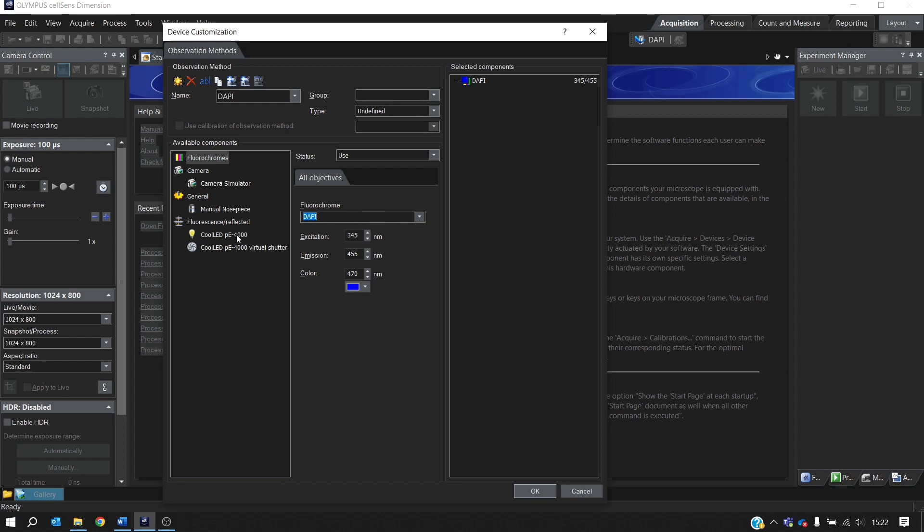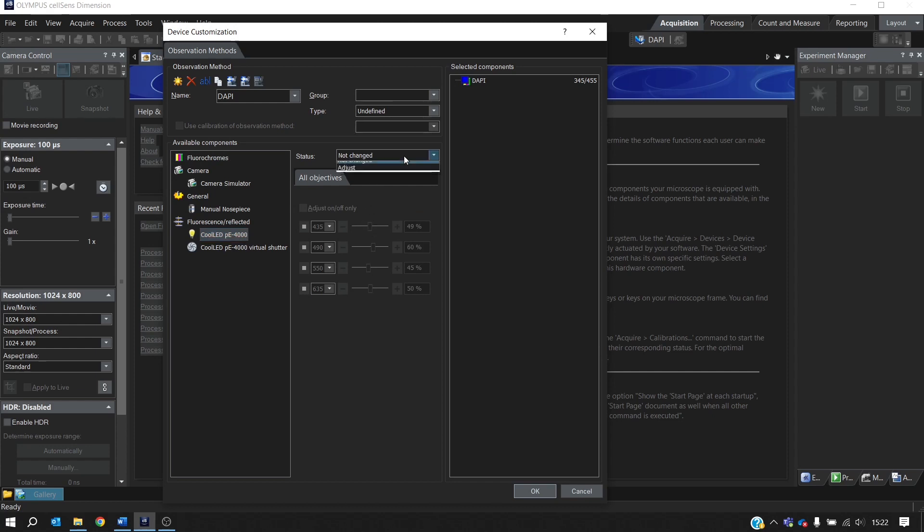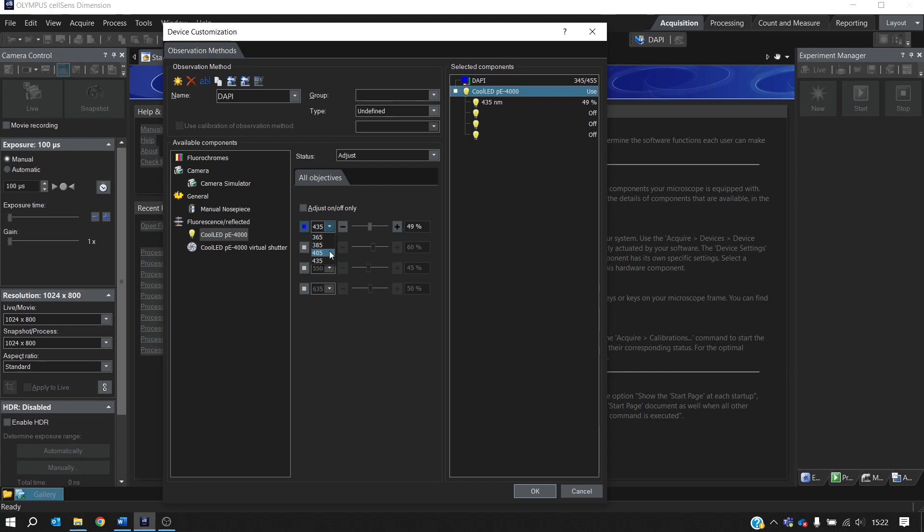Then we need to select the LED. And we'll change the status from Not Changed to Adjust. Then we want to select the first channel and the 405nm LED. And we'll just reduce the intensity.